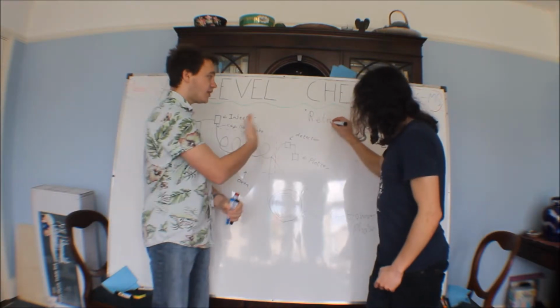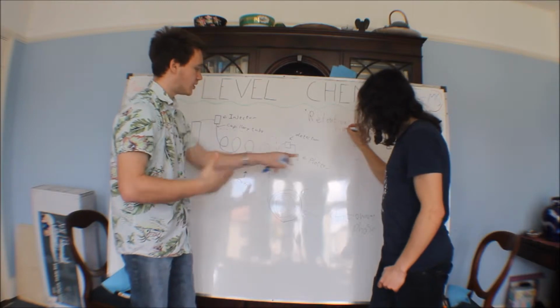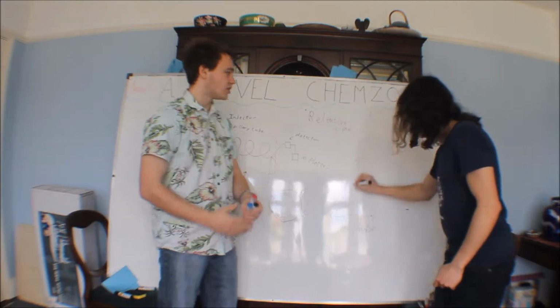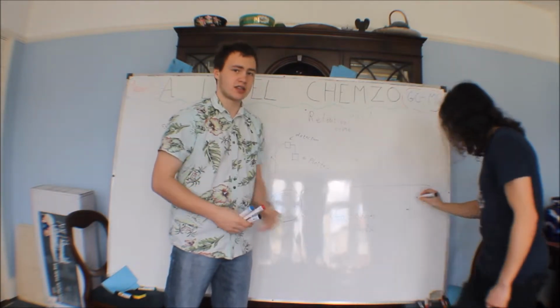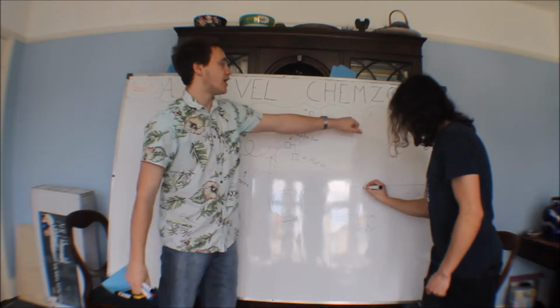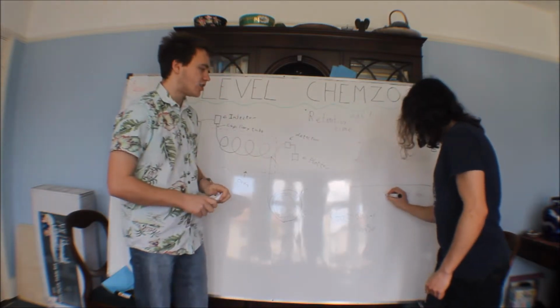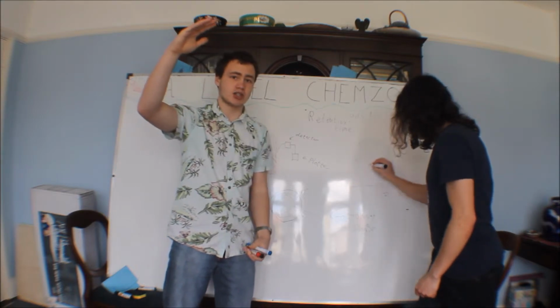So different things go through at different times, and this computer plots some sort of graph of time in minutes, because again, it's quite a lengthy process. Time in seconds, not a lot would happen. It's in minutes against adsorption, and you're going to get various peaks. So lots of things will have a particular retention time.